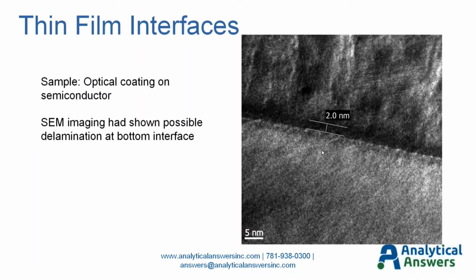And what you see here is that we do not see delamination. Again, delamination being a hole where we have missing material, it would be expected to show bright in this bright field image. And instead what we see is a darker region that looks to be just a change in morphology as we move from the initial stages of the depth into this more polycrystalline, larger crystal size material above it.